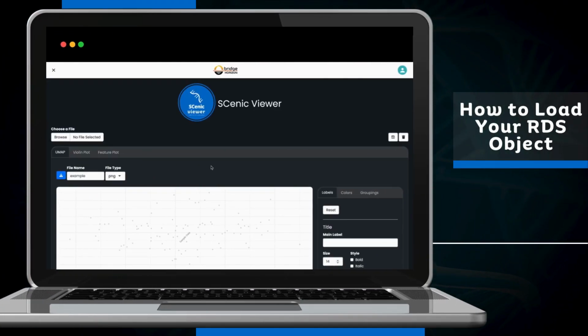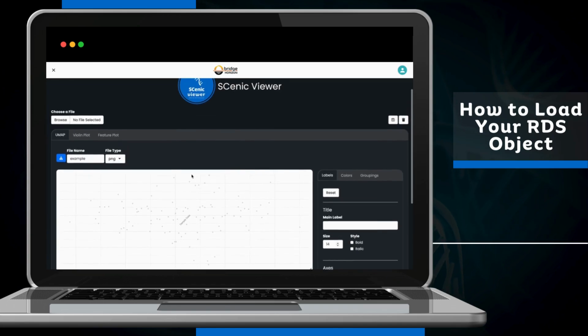Great. So now you have entered SCenic Viewer, which is a visualization tool for single cell RNA-seq dataset visualization. So this is the landing page or the home page for SCenic Viewer.